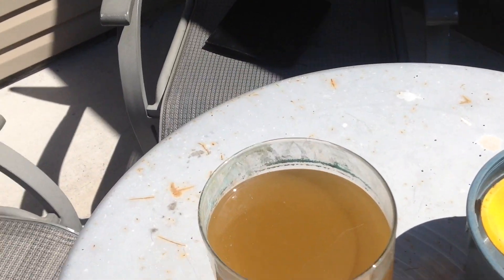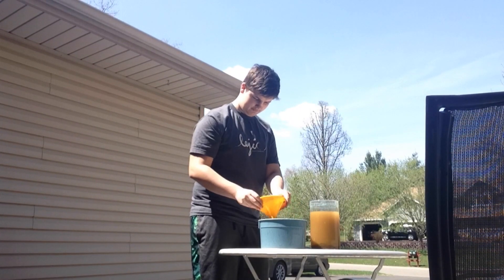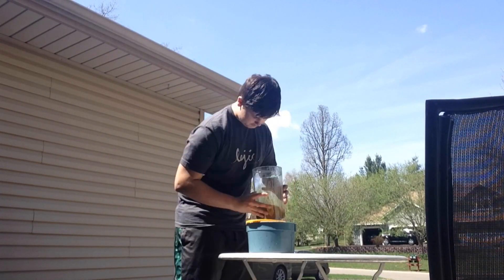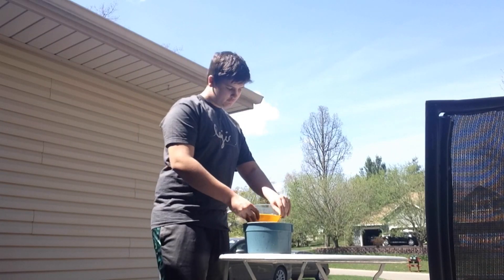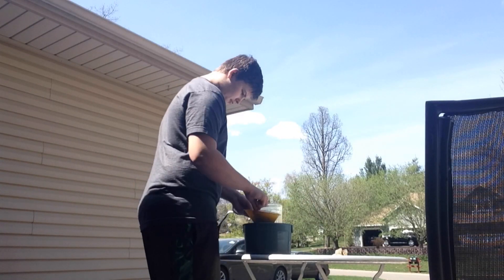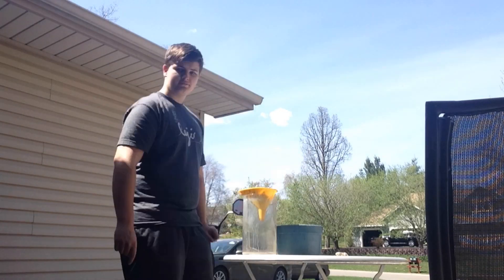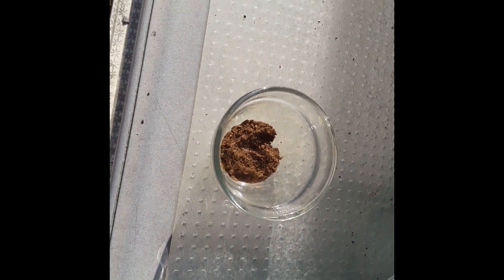Now what we're going to do is filter out the copper oxide with a coffee filter. We've filtered off the copper oxide into this dish here, and we're going to further oxidize it by burning it.